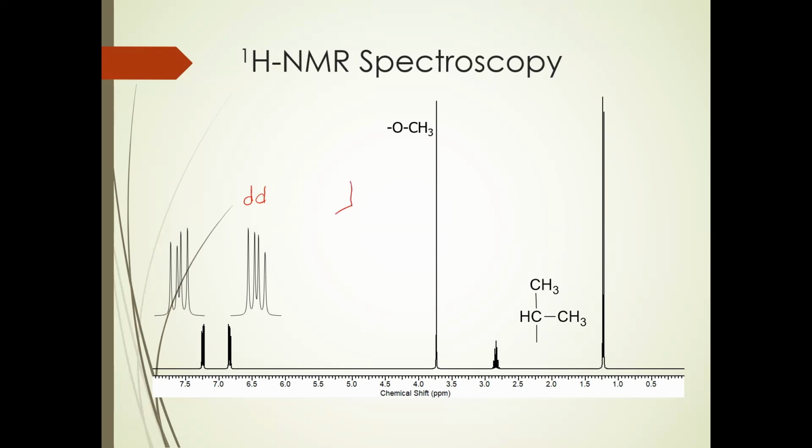It happens when you have one hydrogen splitting it into 2 and you get a doublet, and then you have a second hydrogen splitting it again, but with a different coupling constant. And so you end up with something like this. And so you have the 4 peaks then. And the spacing can be any number of different orientations or varieties. That's a doublet of doublets. If you don't know that, you can also just call this a multiplet.